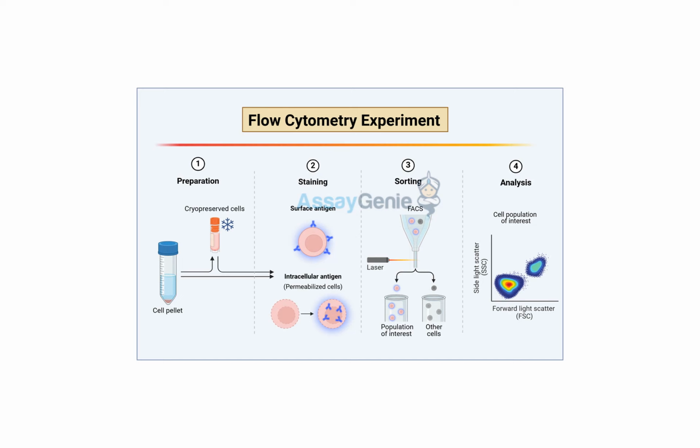All right, so today we're diving into a world that I find just fascinating. Oh, me too. It's like we have this superpower that lets us see what's happening inside individual cells. Absolutely. We're talking about intracellular flow cytometry, or ICFC for short. And it's really like unlocking these secrets that are hidden inside every single tiny cell. It really is. And the things you can analyze with it.